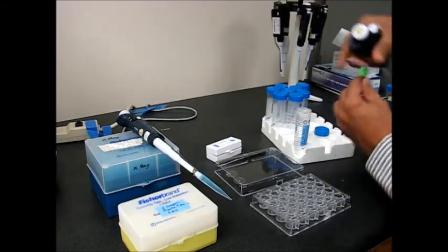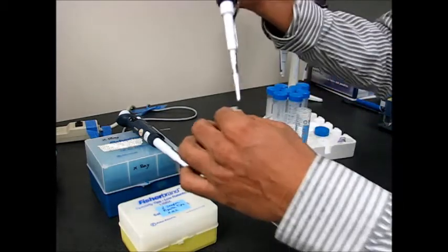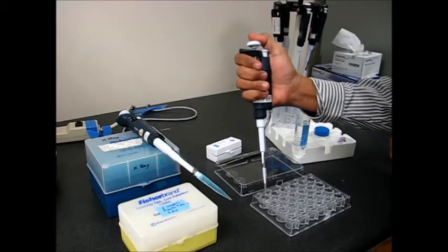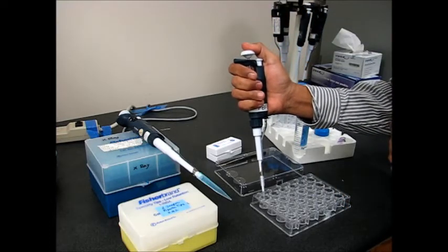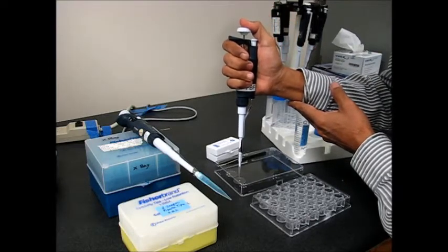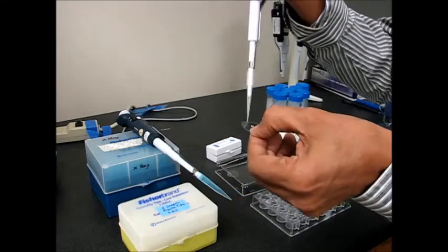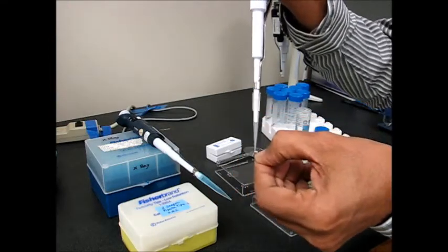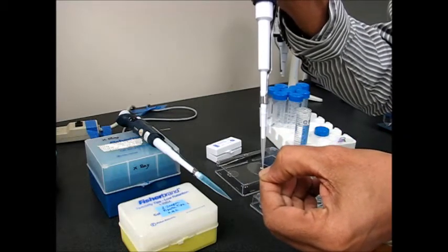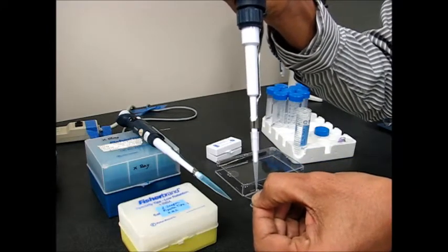After I transfer the cover slip, I put the protein away, change the tip, and then take the same amount of solution from the precipitant and put it on top of the cover slip where the protein is. I pick up this cover slip and then mix the solution a couple of times so that the protein and the precipitant are mixed.